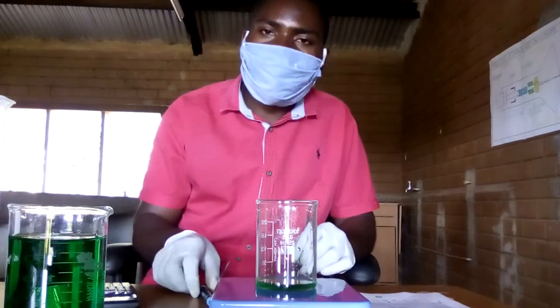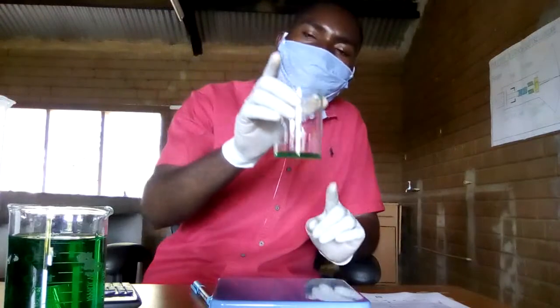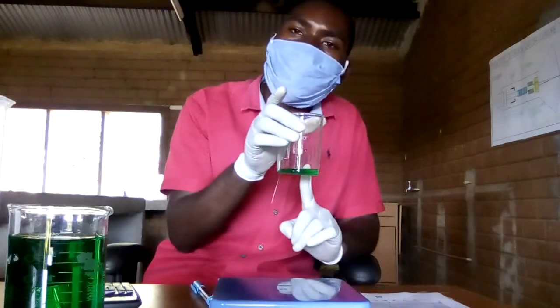This is the mass of both the empty beaker and the liquid.